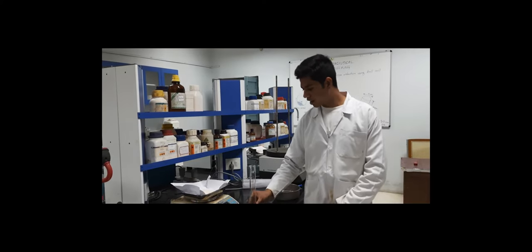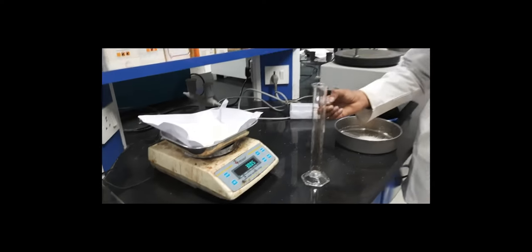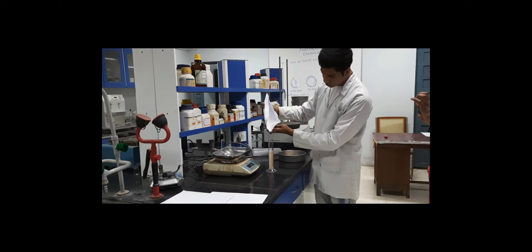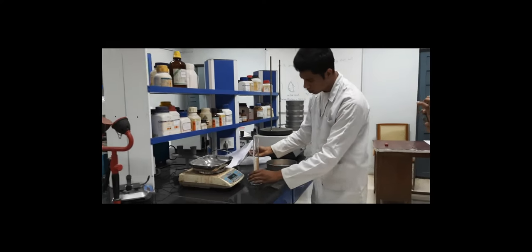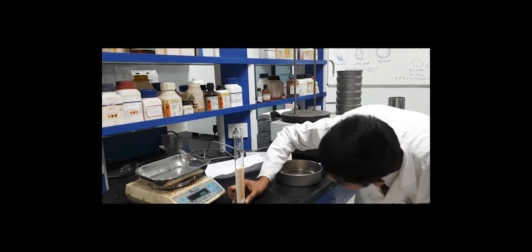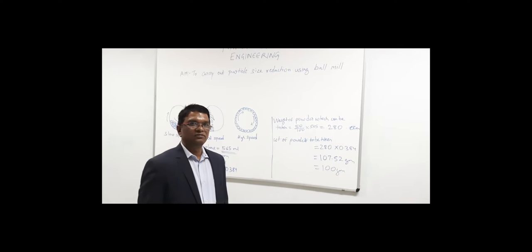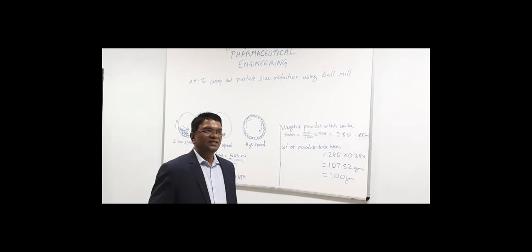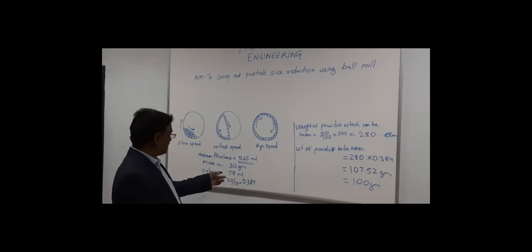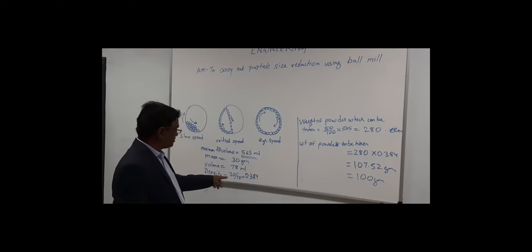Now we are going to determine the density of the powder to be filled in the mill. For that, we have taken 30 grams of powder and transferred it into a measuring cylinder to get the volume of the powder. From that volume we calculate the density using the formula: density = mass divided by volume. After transferring the 30 grams of powder, its volume is approximately 78 ml. The density of the powder calculated is 0.384.